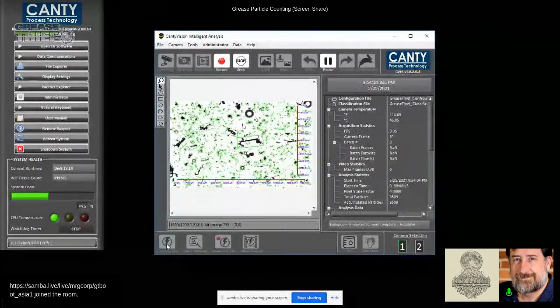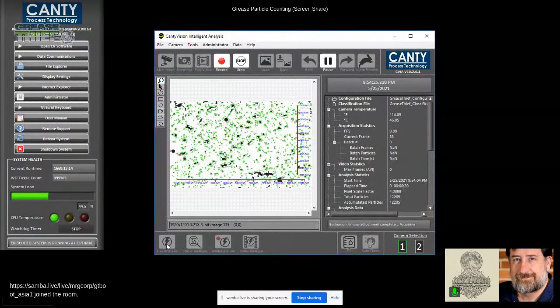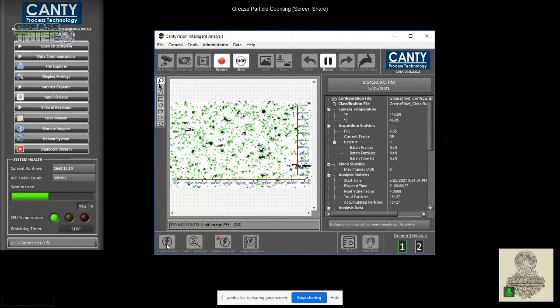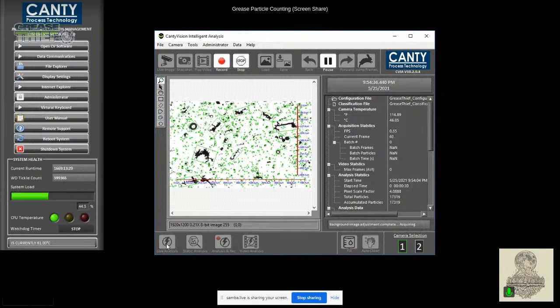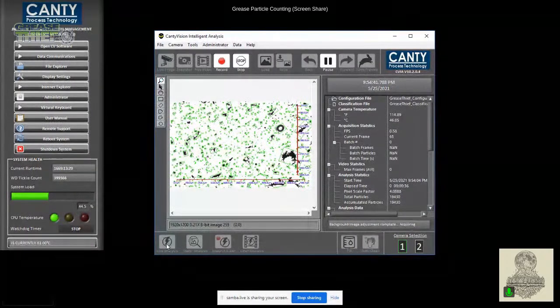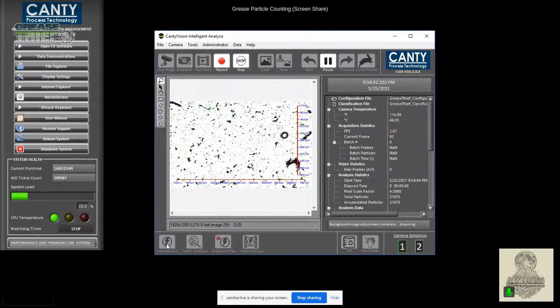It's pretty wild. Yeah, this has got some big stuff here. I'm actually just pulling this by hand because I know there's some air bubbles in here, and I wanted to show that. So I'll try and get it back to a point where I'm seeing an air bubble on the screen. Oh, camera's delayed. I almost had it perfect. So there on the right side of the screen, we can see the air bubble that's stuck in this sample.